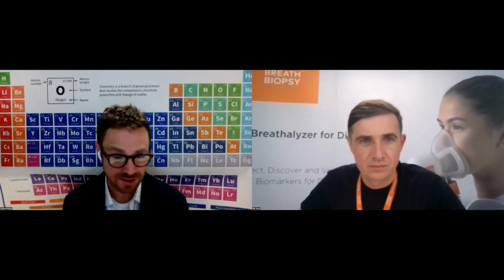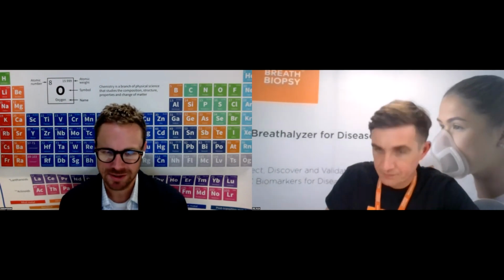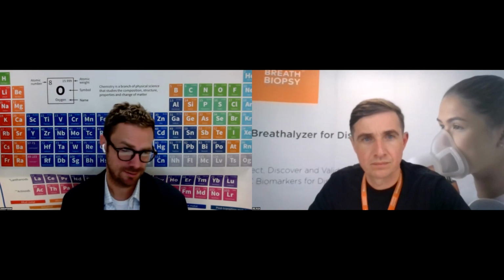Yeah, so we have a researcher that's here that does mesoporous silica, and that is better suited for aldehydes. So I think you can work with different groups, especially he, I believe, works with Supelco, and to come up with novel combinations for what he does. So he picks a lot of targeted types of things. So he gets those media made specifically to target those analytes of interest. And so we are generally in a discovery scenario. So I try to grab as much as I can, rather than pick certain things. That may or may not be the best approach. It's just how we've gone about doing it.